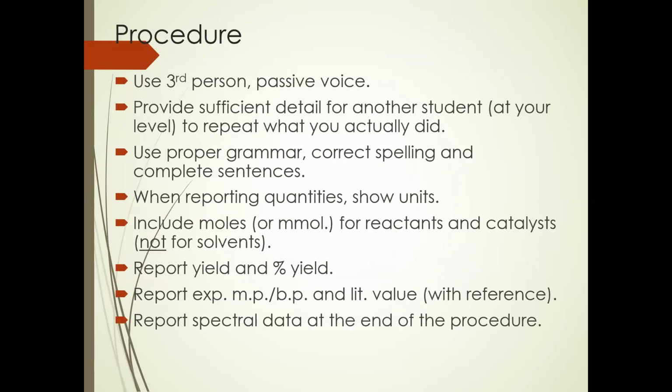Anytime you report quantities, also report moles or millimoles, and you can have that in parentheses right afterwards. So you can simply have 2.78 grams, parentheses, the number of moles or millimoles. And if it's a solution, you could have something like 6.7 milliliters and then 6.7 millimoles, but also give the concentration. So for this, it would be a 1 molar solution. And then state what it is: sodium hydroxide, KOH, ethyl bromoacetate, whatever it is. But you can specify it in that way, and it's understood the millimoles and the molarity go with that compound.